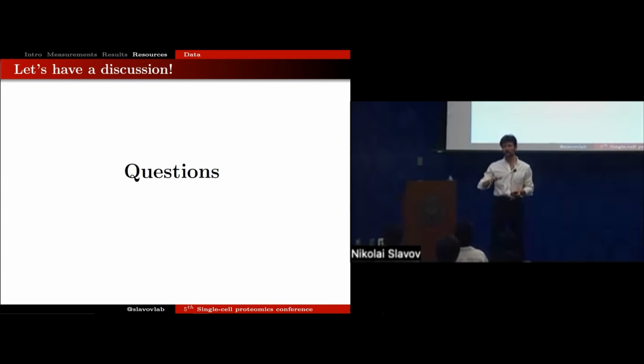We have also tried to simulate internally, completely simulating the Orbitrap transients, resolution, and all of this. So there will be a limit, especially for the bulk samples. My guess would be around 10 plex for bulk samples. For single cells, I think it's much higher. It could be 100 or higher plex, certainly what we hope to achieve. And at that point, the throughput of single-cell proteomics will in many ways catch up to or exceed the throughput of single-cell RNA-seq if we get there. And I hope we will.